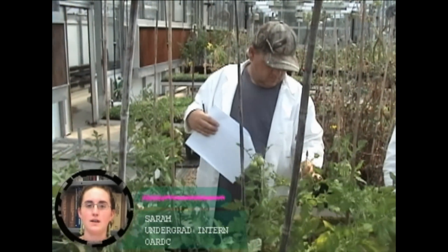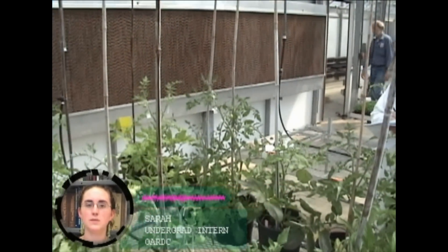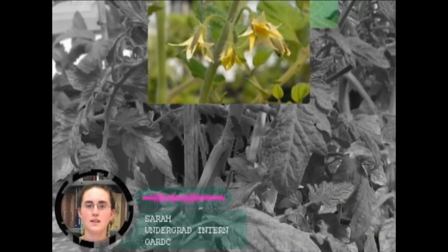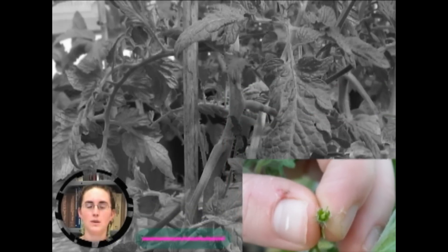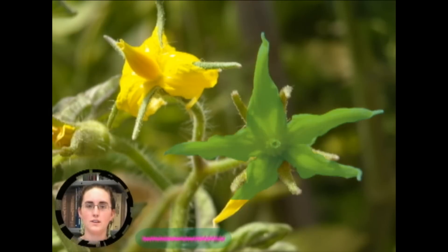Plant breeding is dependent on having various populations. To establish these populations, we first make crosses between two individuals that have traits that we are interested in combining. Our greenhouse is set up with sections for male and female plants. Each individual plant gets a different genetic combination, and we keep close track of the crosses that are made. The male plants will be donating the pollen, and the female plants will be donating the ovule.